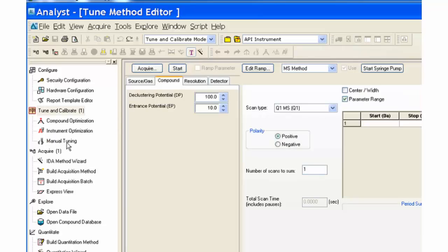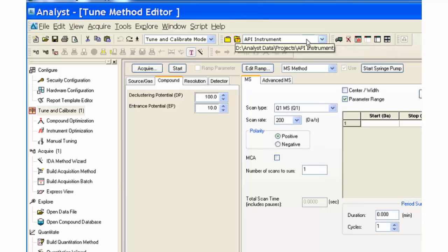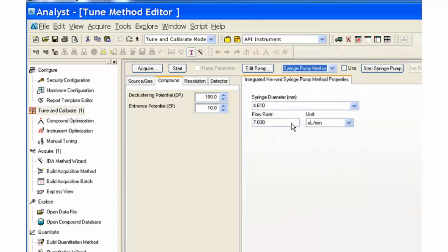Open the Manual Tune window. Choose the API instrument project. Enter the correct plunger diameter for the syringe and set the flow rate to 10 microliters per minute.